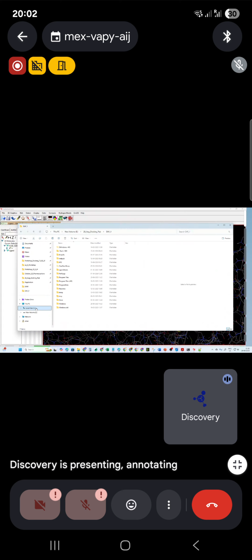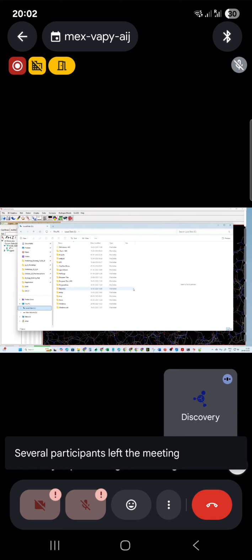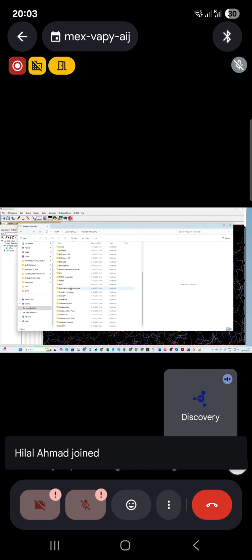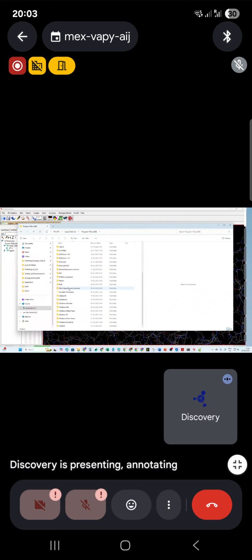When you install AutoDock 4, if you follow the default option, it will be installed in this Program Files (x86), then the Scripps Research Institute, and under this you have AutoDock and then the version, and you have these two files.